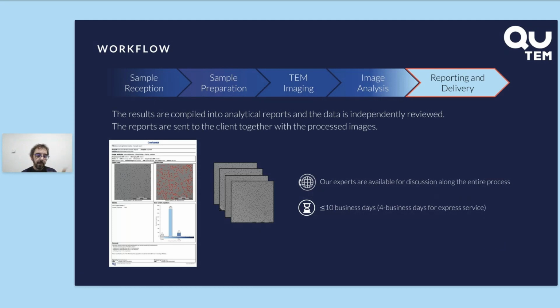Typically, we compile all the most important information in the report, so some representative images, and whichever data was asked or required by the customer in the quotation.